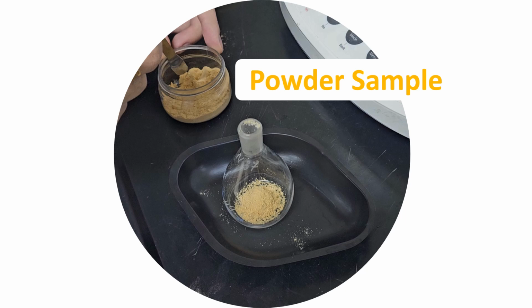How to prepare the sample? First, we need to dry bread at 80 degrees C for around 2 hours and then ground it into powder. The moisture content was measured as 5 gram per 100 gram sample, that is 5%. We use this powder sample to measure material density.